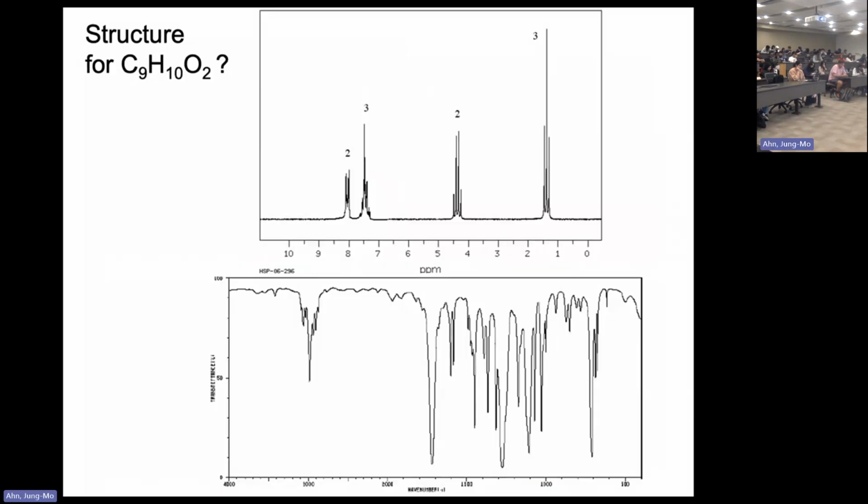Anyway, so, let's start solving. All right, this time you see here, I'm starting to give out two spectra together, right? And each technique gives different information. NMR can give you a particular structure, maybe not the whole, but it gives a structure of the molecule.